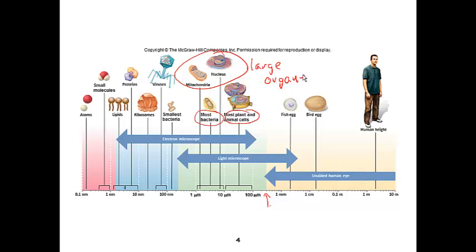But when you get down to about 0.2 micrometers or 200 nanometers, the light microscope becomes limiting, which prevents us from seeing very small bacteria, viruses, most organelles, and at the atomic and molecular level, we're obviously much more limited with the light microscope. So the electron microscope gives us details that we couldn't get for those objects.